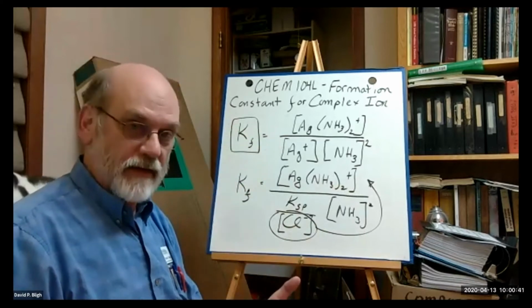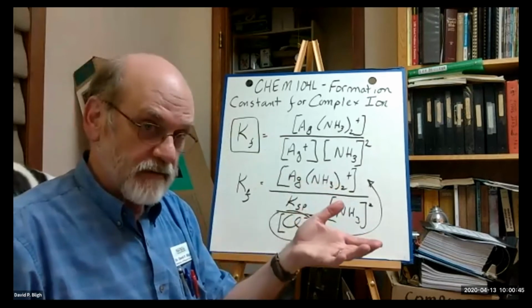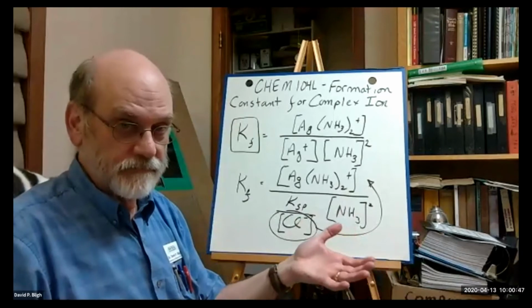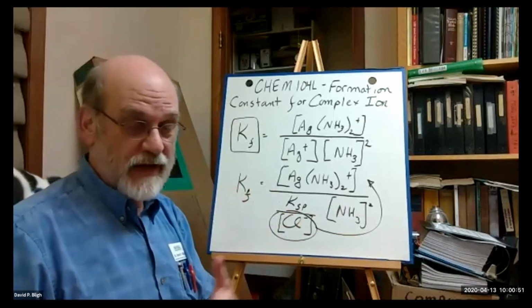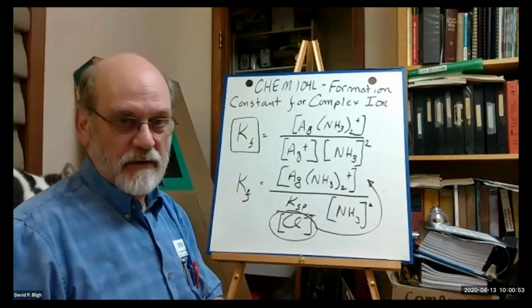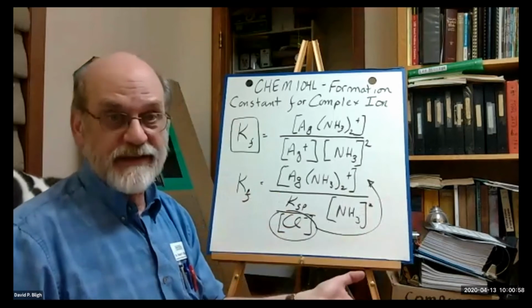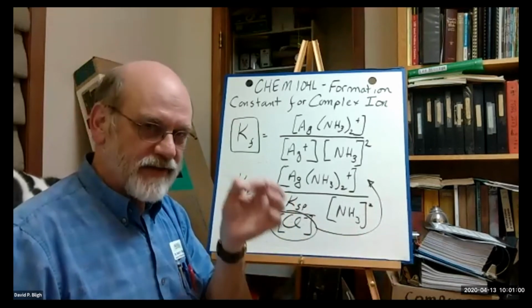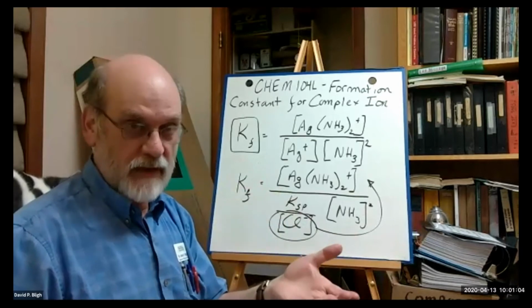How do we know that? Well, we know that because it forms that precipitate that you've seen before. Only it's very, very faint, right? Before, in Le Chatelier's lab, we just made a lot of it so you could see it easily. But we want to find out exactly when it forms. That's our endpoint.